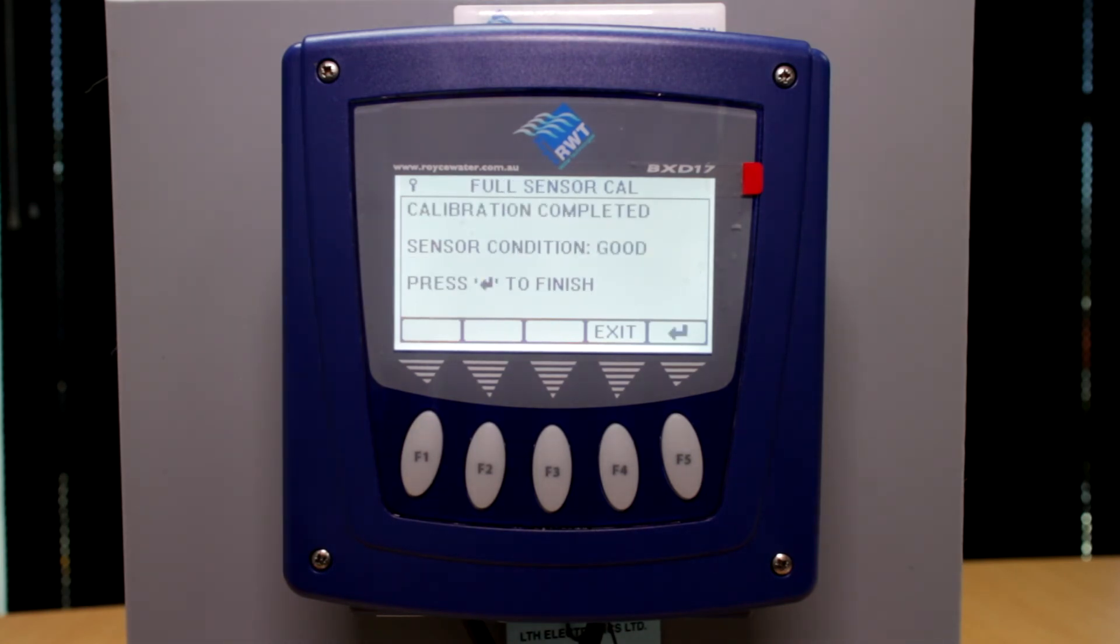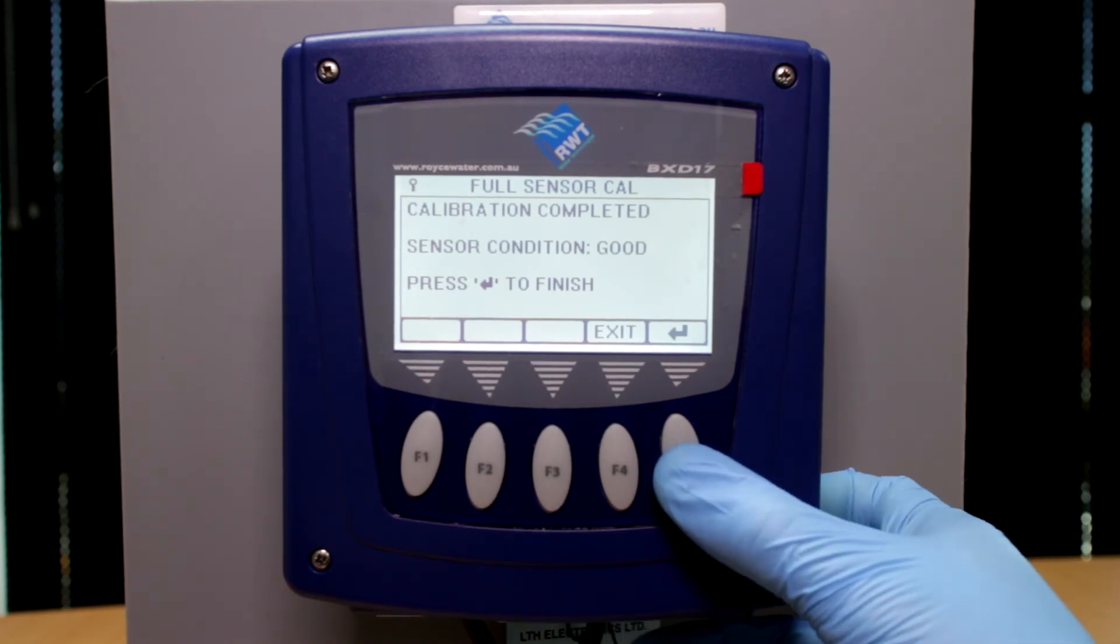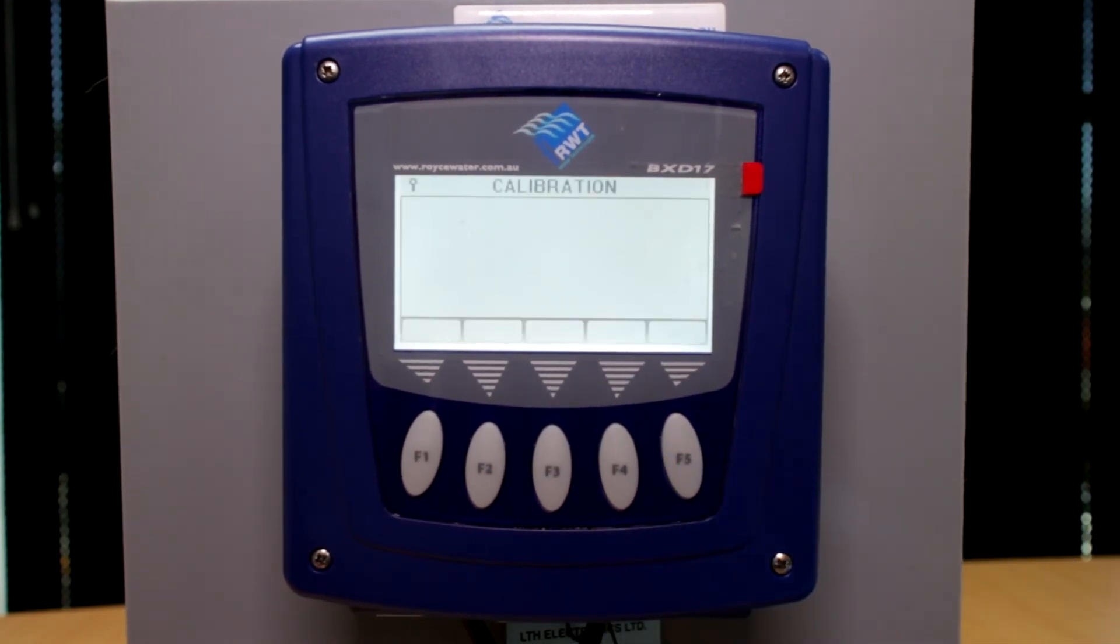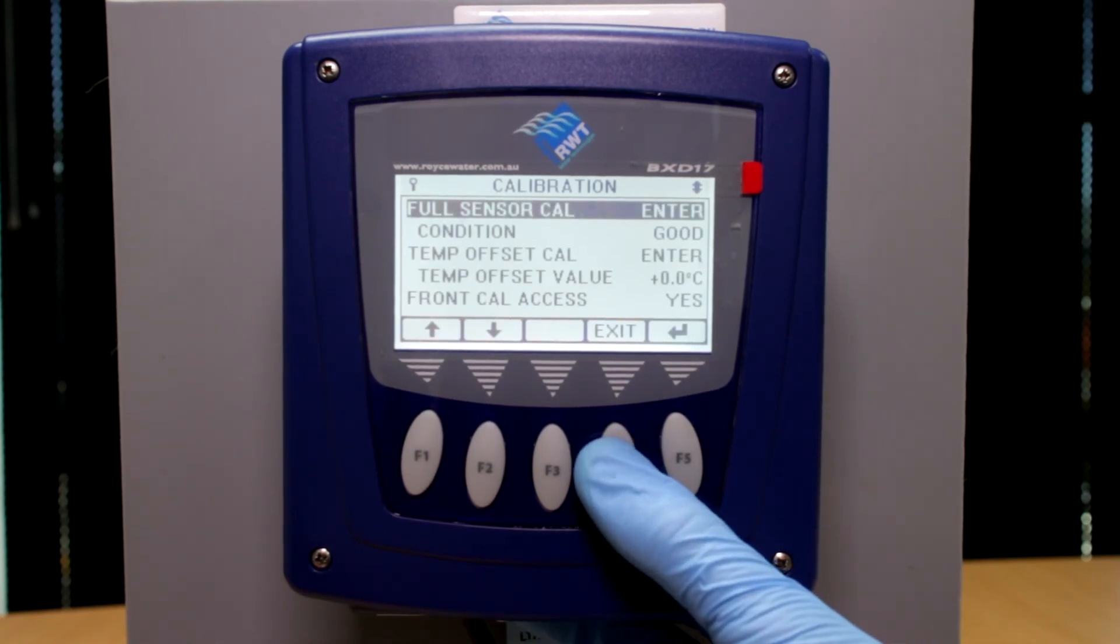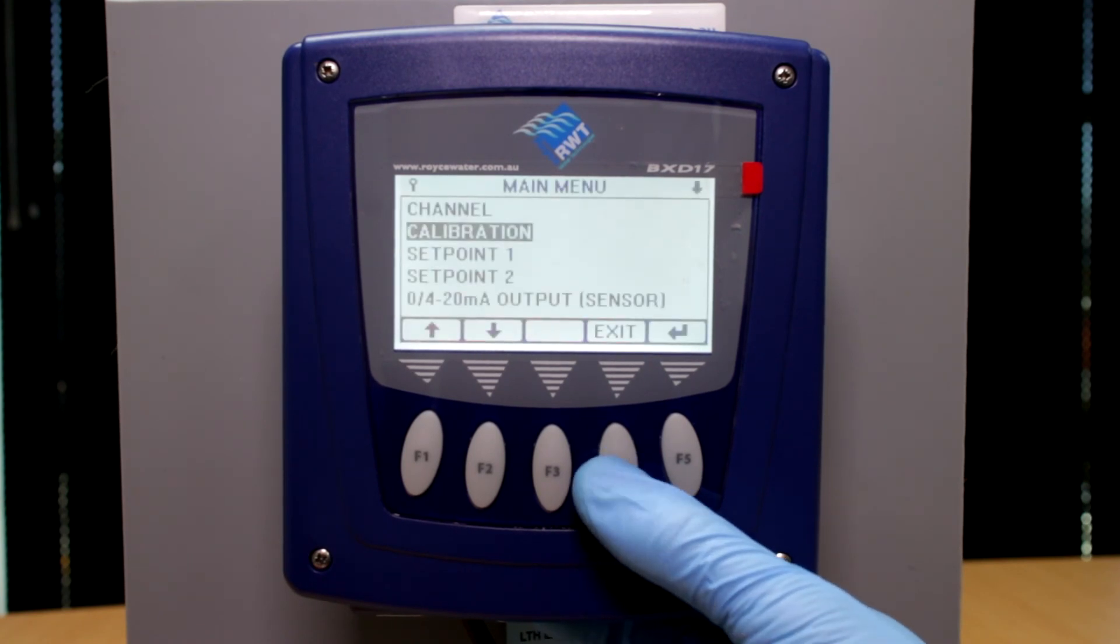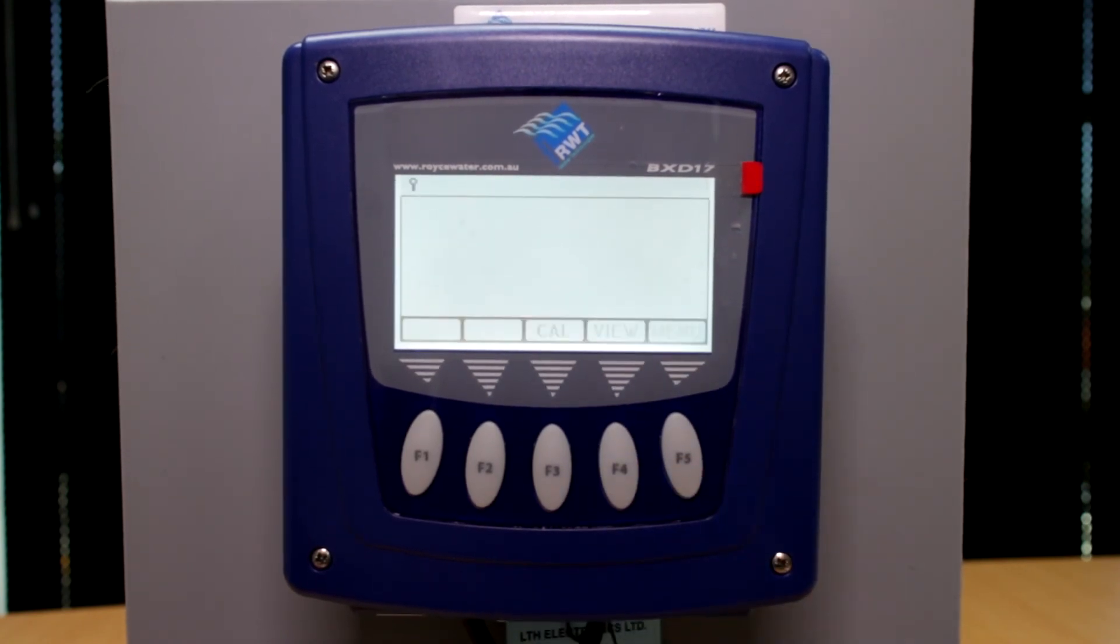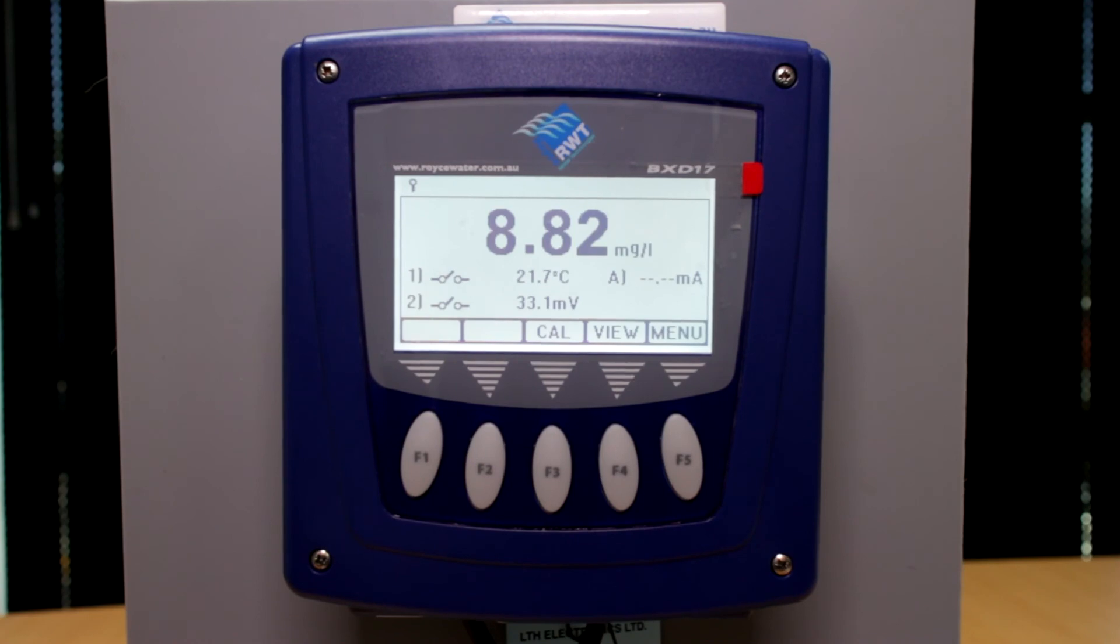Once this has been completed, it will give you a sensor condition and we can push enter. And exit which is F4, and exit again. The sensor is now completely calibrated.